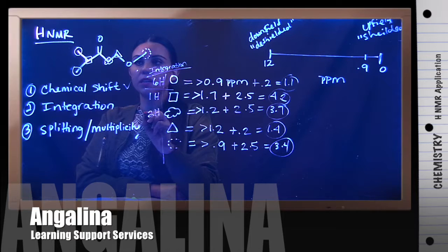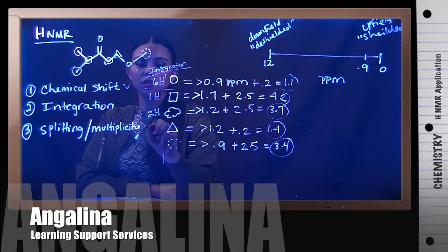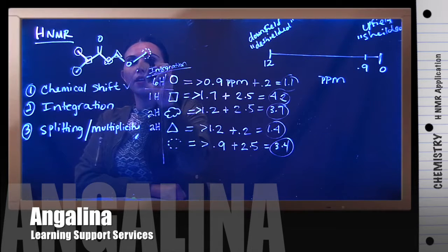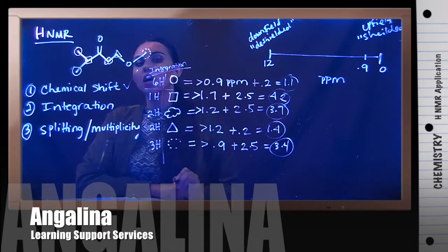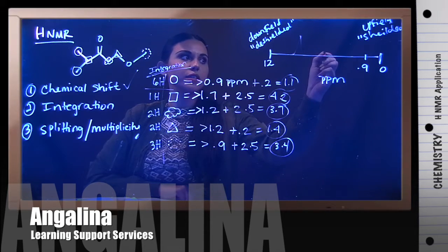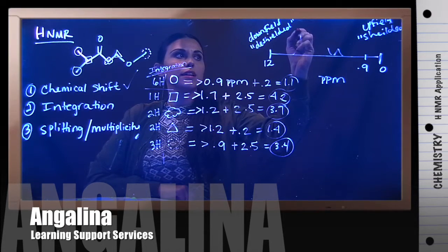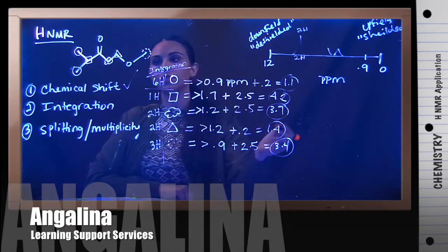And if you guys are asking how I'm getting these hydrogens, all I'm doing is looking at the carbon. We know carbon's supposed to have 4 bonds. So in this case, carbon had already 2 bonds, so we have 2 implied hydrogens. In this case, it's the same thing. 2 bonds, so 2 implied hydrogens. And then here, 1 bond, so 3 implied hydrogens. That's it for integration, very easy. Normally, when you're looking at the NMR spectra, they're going to give you a value. So sometimes we're going to see these signals like this around there. They'll usually give you like a number up here. So for instance, like 2, or sometimes it'll be down here. That's just the integration. That's telling you how many hydrogens you have per signal.